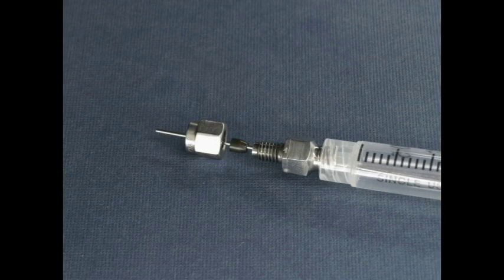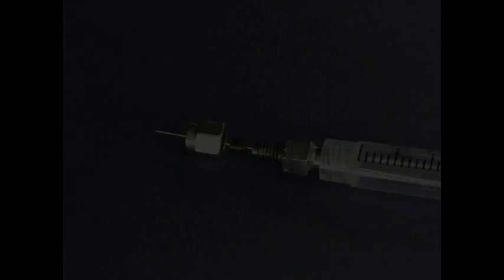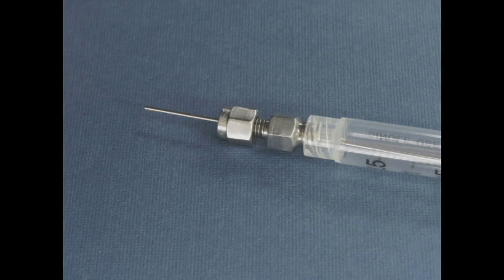Second, instead of using the metal ferrules, our hypodermic adapter ferrules give us the flexibility to connect hypodermic tubing to anything that uses a lure. For example, these can be used to make a custom dispensing needle, which we demonstrate in the video we've linked below.